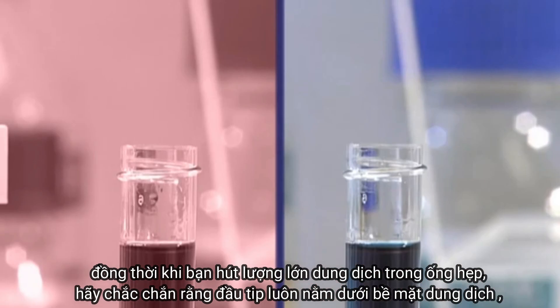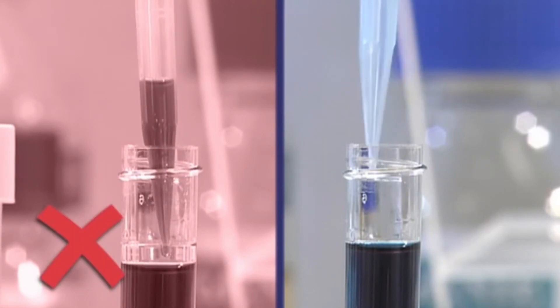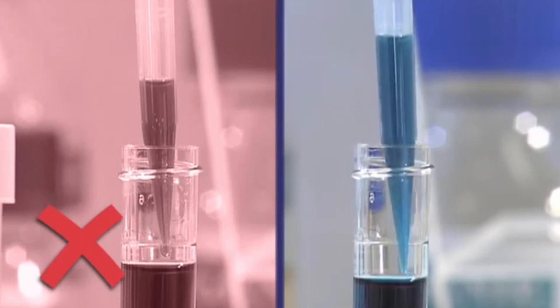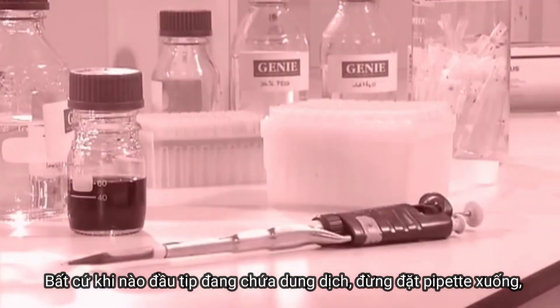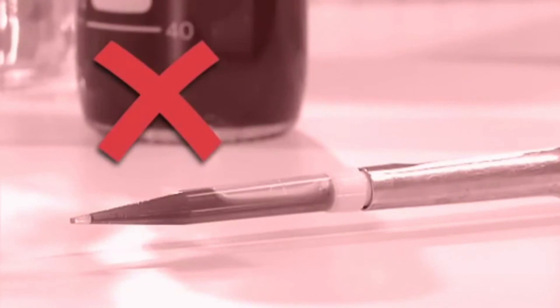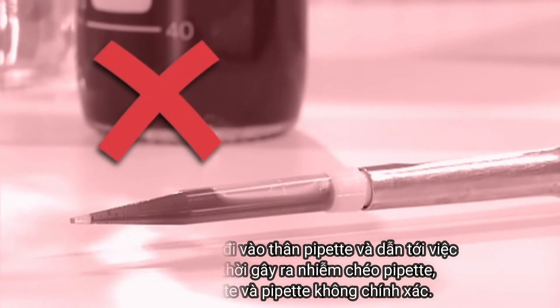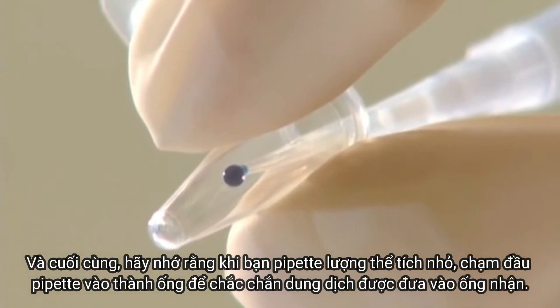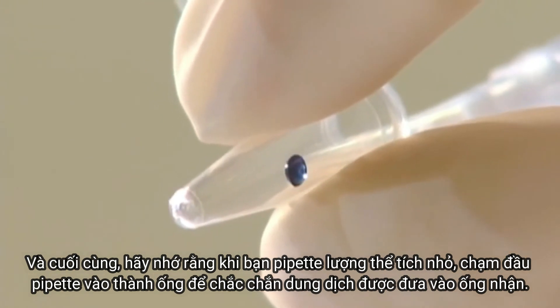When withdrawing a large volume from a narrow container, make sure the tip stays below the surface. Whenever you have liquid in a pipette tip, don't lay the pipette down — liquid can get into the body of the pipette, causing cross contamination, pipette damage, and inaccurate pipetting. Finally, remember that when pipetting small volumes, touch the pipette tip to the side of the tube to ensure the liquid is released into the recipient container.